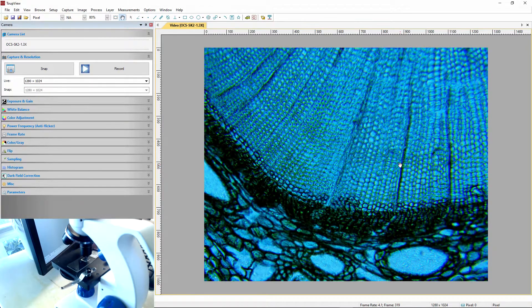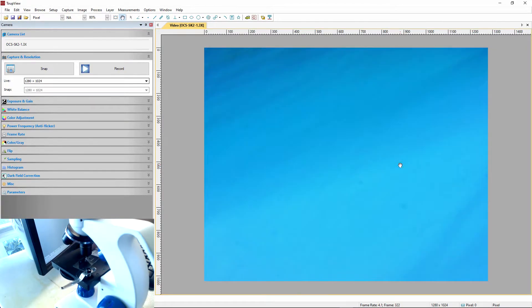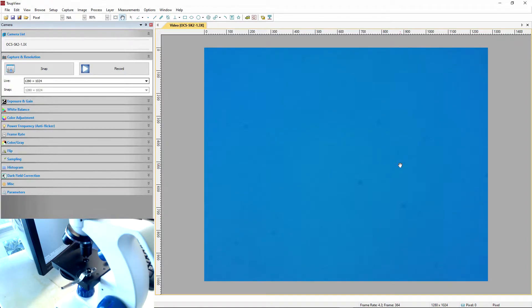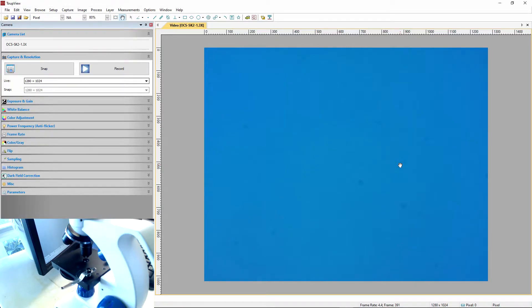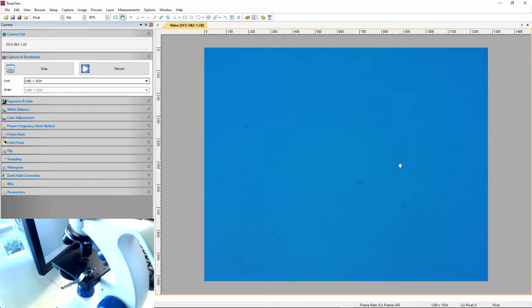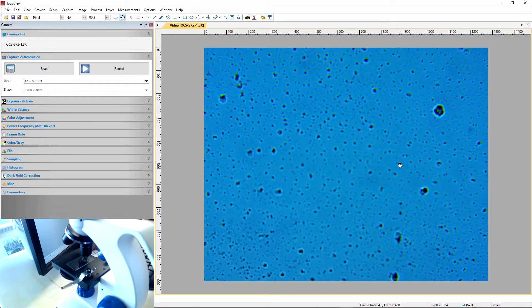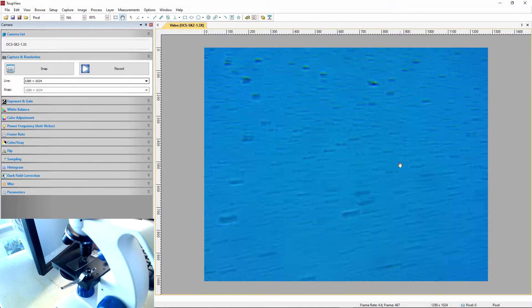So, there's that. I'll try with the next one. I'm just kind of experimenting with this video. Because I was running out of ideas. So, I'll try the next thing. Well, sunflower stem. Try that.